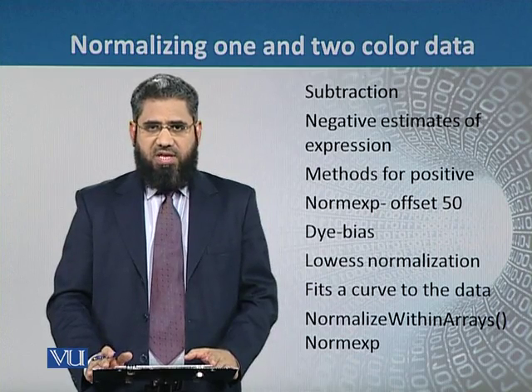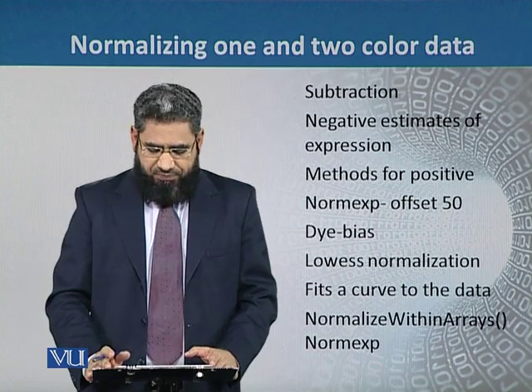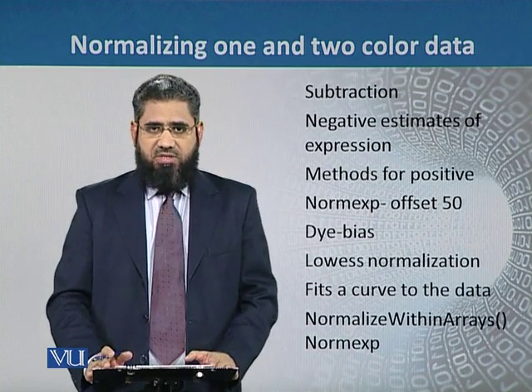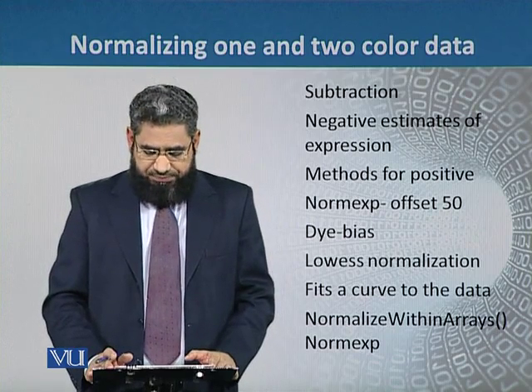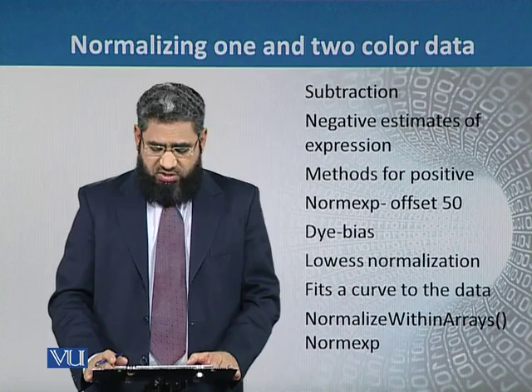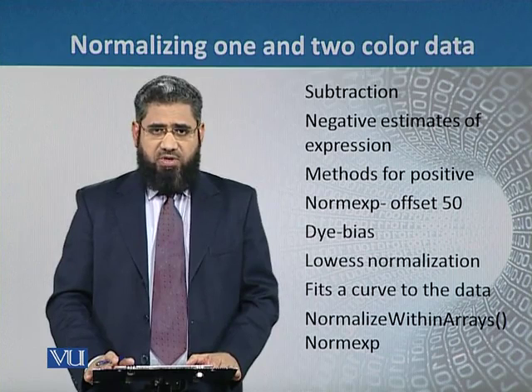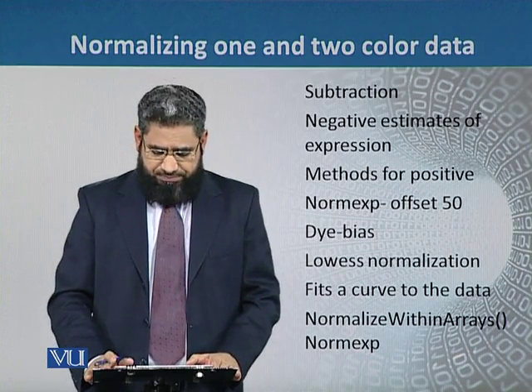So when we use these dyes as a chromogen and dye the samples, this difference in the dye color hinders the proper processing of the data. To overcome this dye bias problem, we have another tool that is known as the loess normalization. When we use the loess normalization, the problem of dye bias can be overcome.